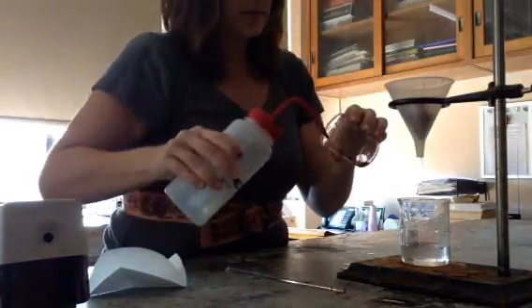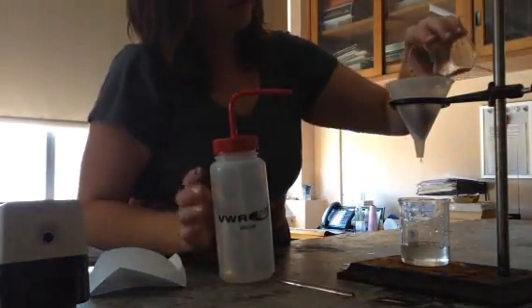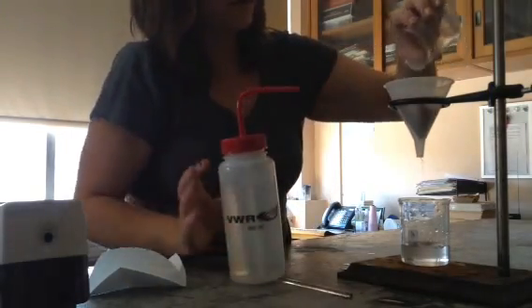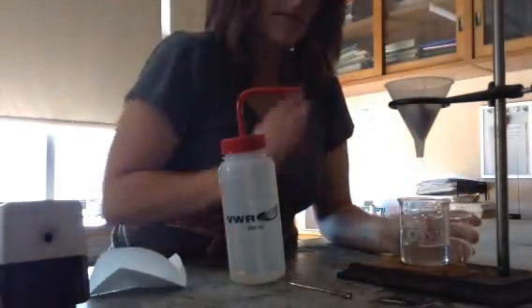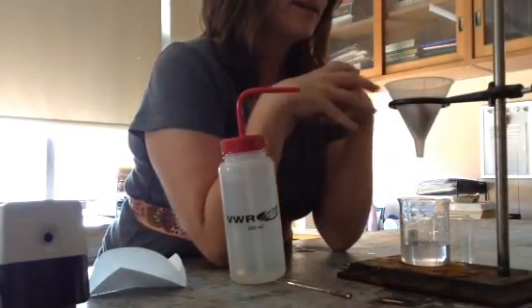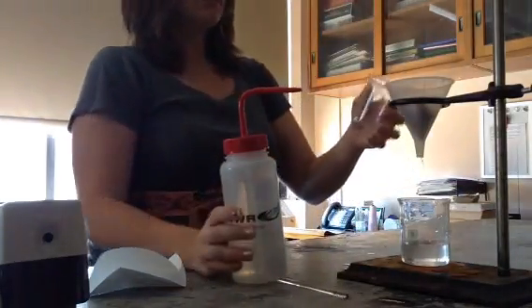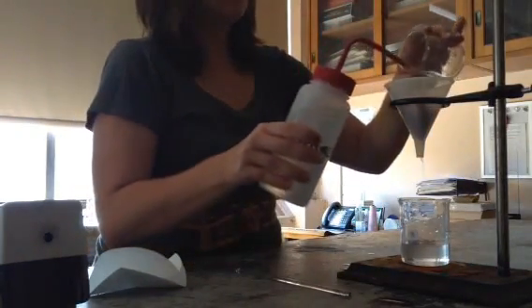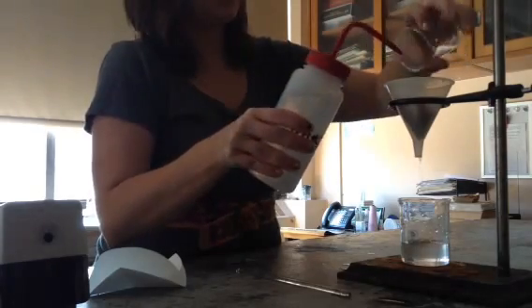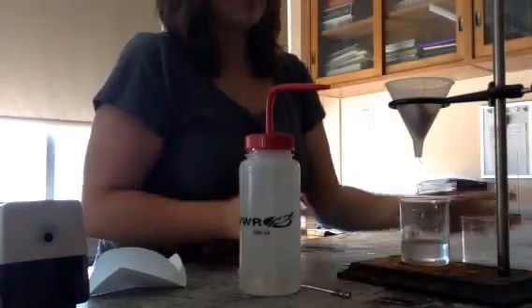Got to do it again — still got some left in there. Again, a little squirt and pour, and there we go. So that's going to filter on through, and when I'm left, all I'm going to be left with up top is a nice dry solid. It's going to have to dry for a little bit — maybe overnight, maybe for the class period. Get as much of this as I can. And that is how you do your filtration.